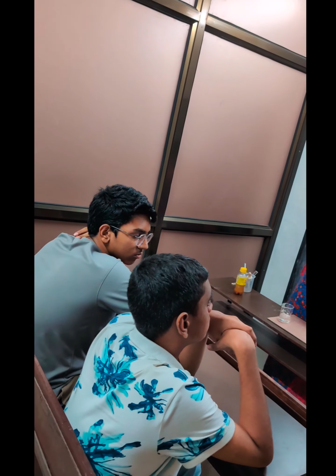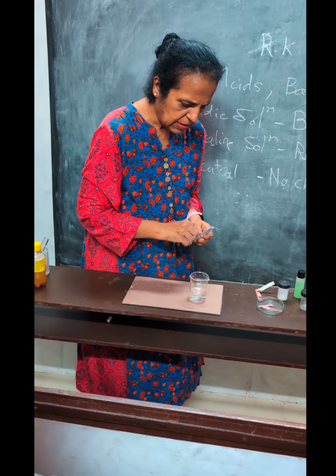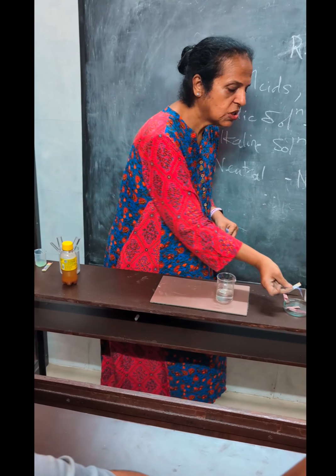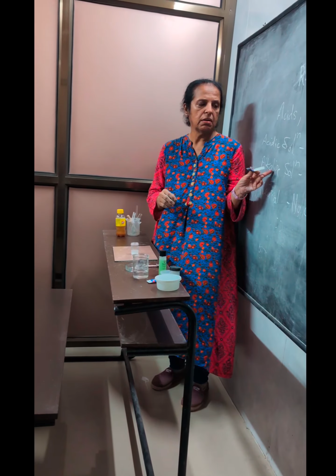Let me try first with this. This is just plain water. Plain water I can just directly use. What should happen? Blue litmus, and blue remains the same. You also see that. What is baking soda? What do you think is baking soda? A base. So what should happen?